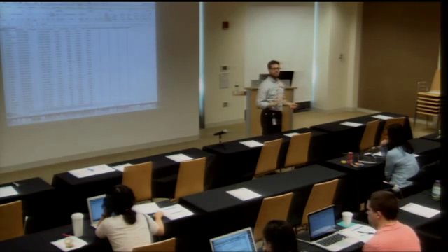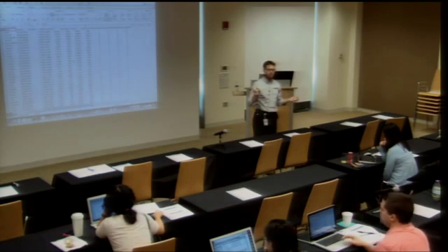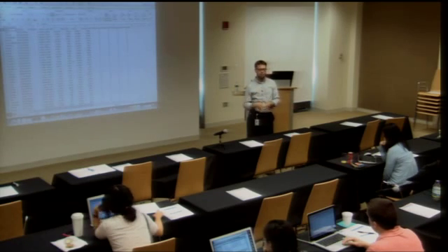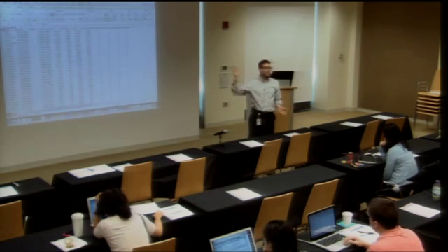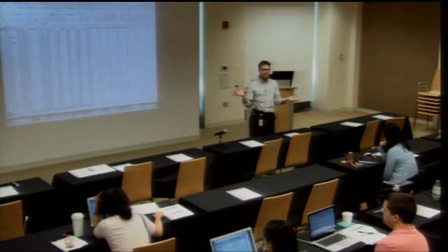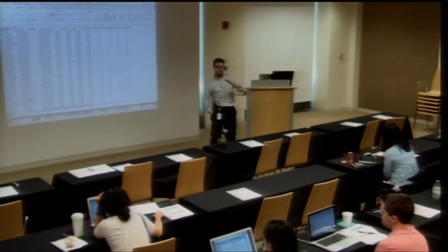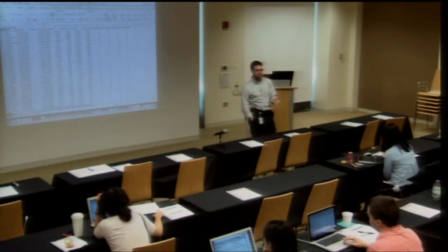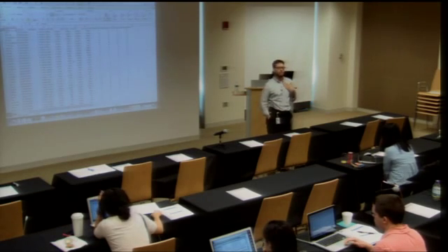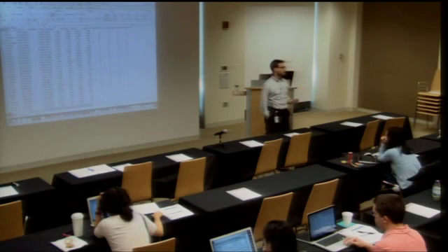If you're doing a positive selection screen where you get your sequencing back and you realize, okay, there are 5 hairpins that scored and the rest are all zeros, you'll still get a number for those zeros. They'll still have a rank, but that rank is totally meaningless, right? So there is definitely a level of you want to go back and look at your data and make sure, okay, does my hit list match up with my intuition of how far into a hit list I should go? Absolutely.